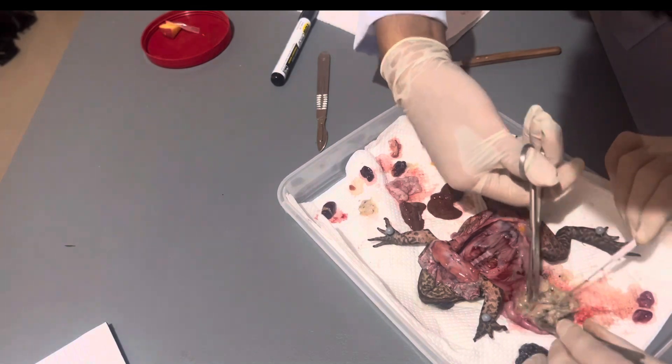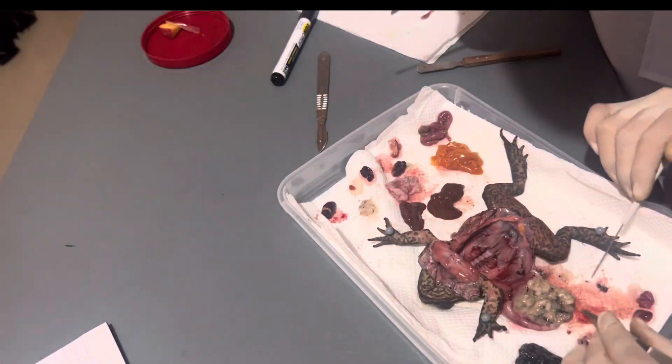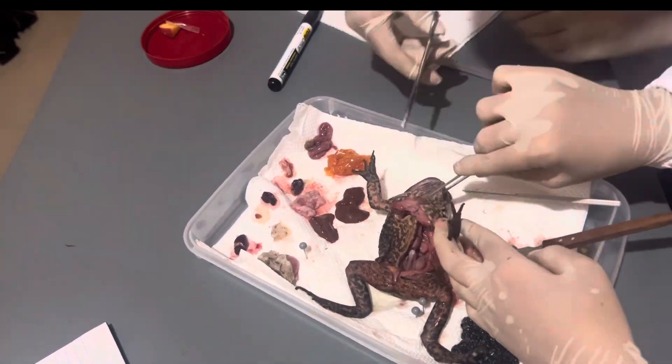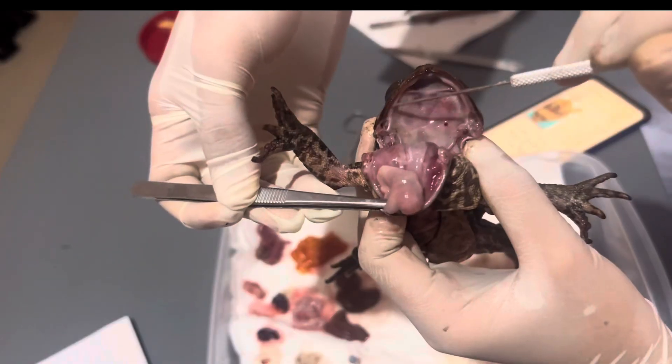We then open the stomach of the toad in order to look at what it last ate. We saw mosquitoes, rice, and ants. Let's proceed now to the buccal cavity of the toad.